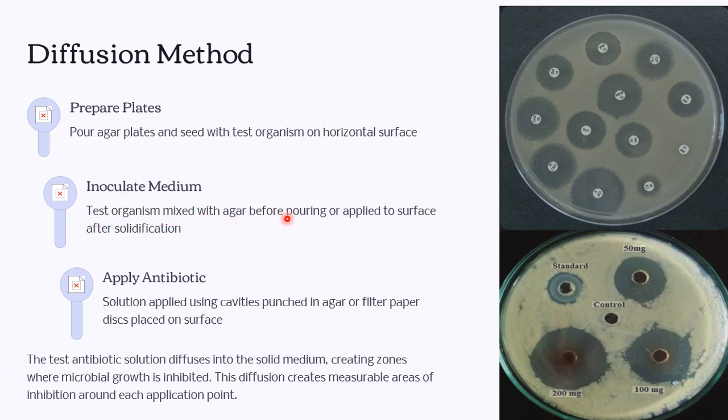The test organism is either mixed with the agar before pouring or applied to the surface after solidification of the agar medium.